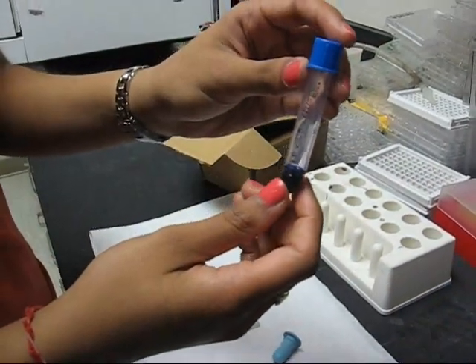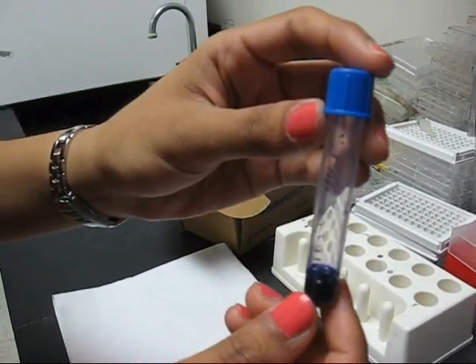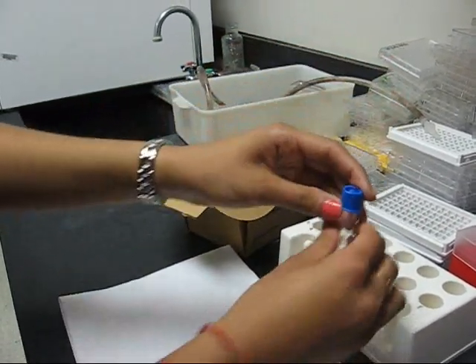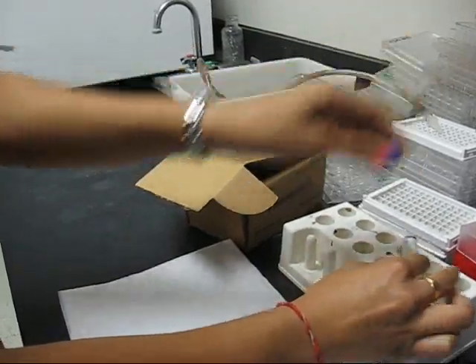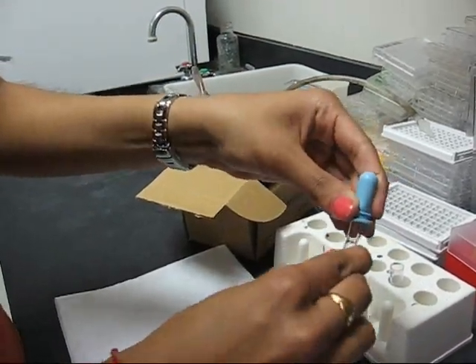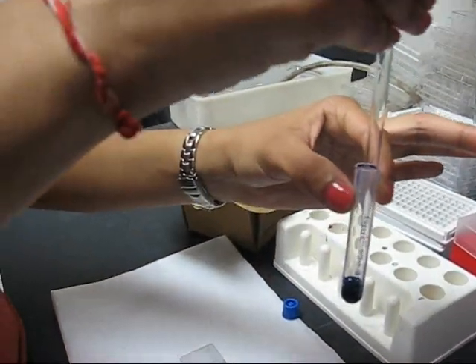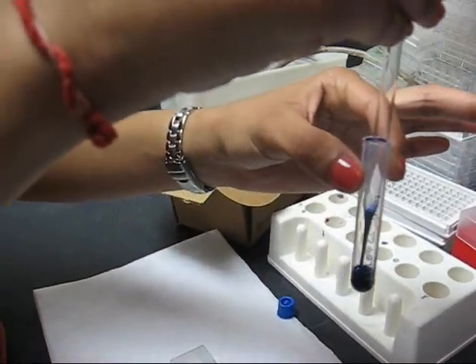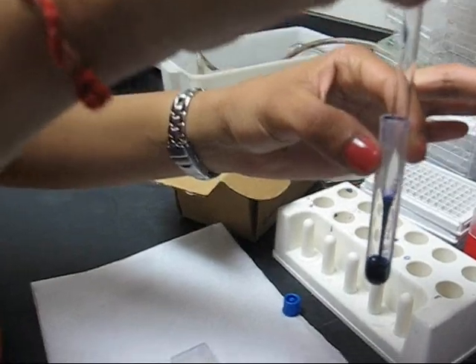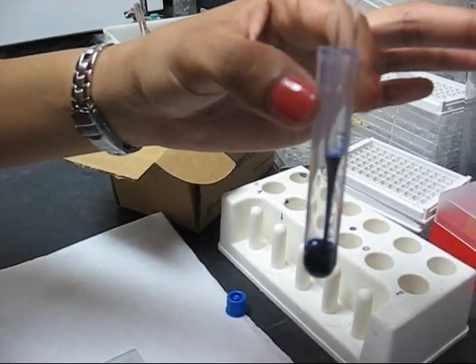Your cell suspension and Trypan Blue mixture is now ready to be placed on the hemocytometer. Take a Pasteur pipette and mix the mixture thoroughly to ensure an even distribution. Try not to get any bubbles in there.